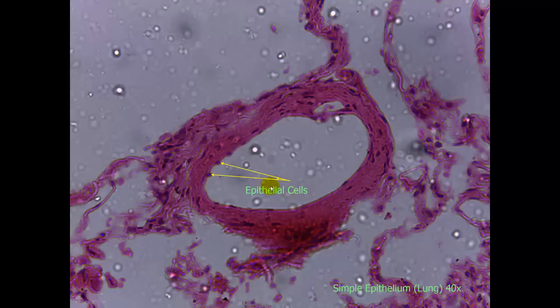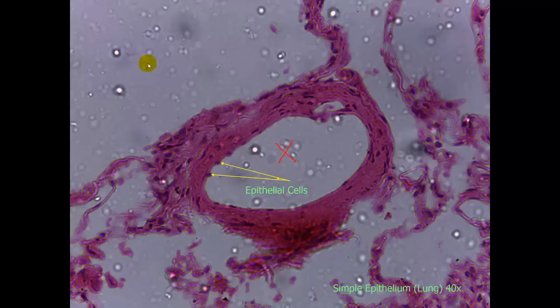Here we have a slide at 40x objective of simple epithelium in the lung. When you are looking for epithelial tissue, this is lining tissue that has very little matrix outside of the cell, so you won't see much or any vascular tissue such as blood vessels within it. You are going to be looking for the lumens, such as you see here. A lumen is an open space within the tissue slide, or at the edges of the slide itself. You will find epithelial tissue in either of those two places.